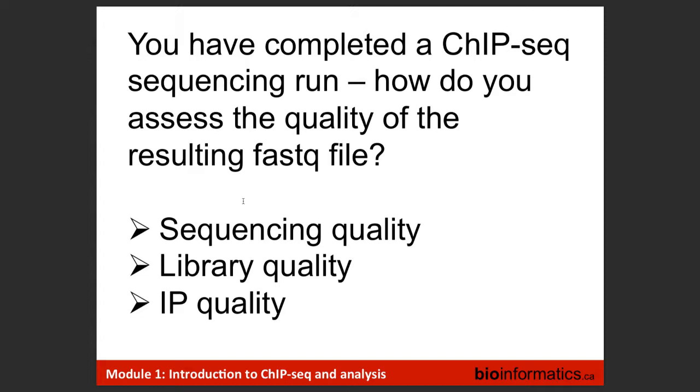But I just wanted to briefly mention, okay, you've completed your ChIP-seq experiment, or you've obtained the data from a collaborator, or you've done it yourself. How do you assess the quality of the resulting FastQ file? So really, there are three main ways.